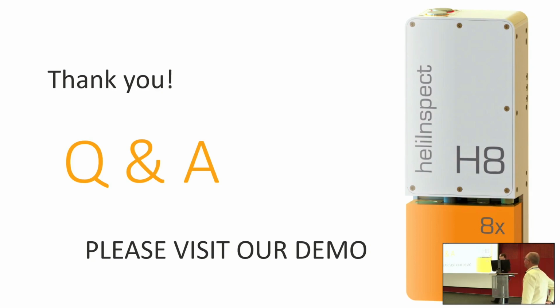Yeah. So I didn't compare them directly to others. However, I actually did indirectly. Let me explain: the artifacts that you buy are certified with other instruments. So for example, the Symmetrics artifact has the R parameters with a tactile probe and the S parameters with confocal microscopy.